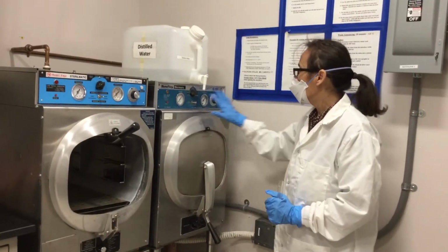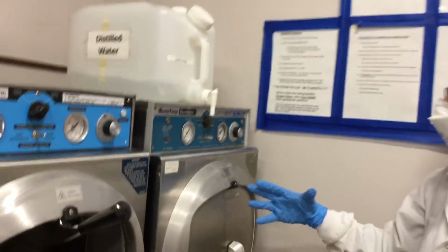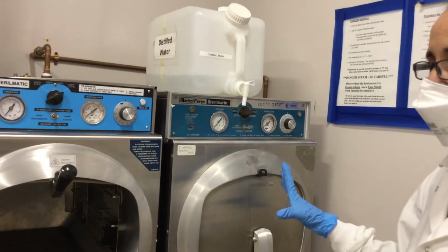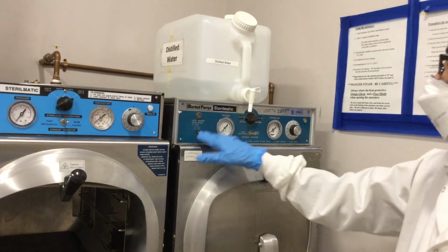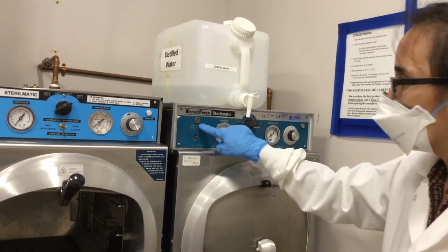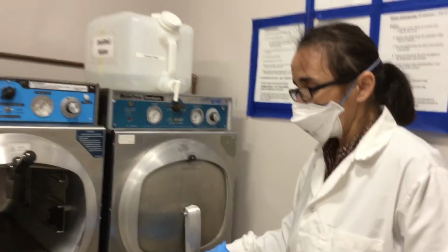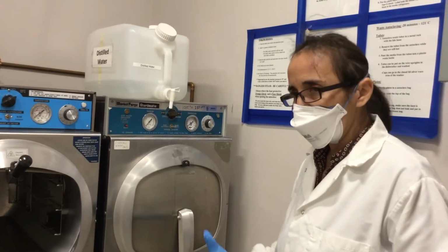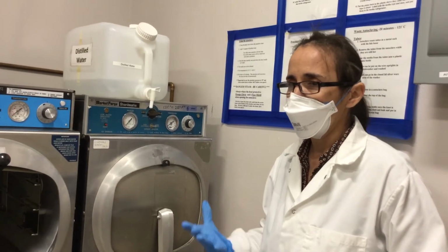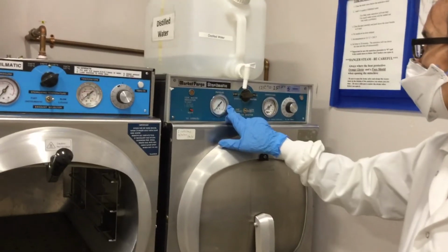Now here we have all the indicators for how to operate this. So here we have a reset button just in case something happens in the middle of the process and you want to stop the machine from working. We don't use that. We do everything correctly. This is a low water indicator that, if you don't add enough water into this chamber, will tell you, you know what, I need more water to build the pressure, 15 psi, pounds per square inch. And then here is an indicator of the pressure that it reaches.